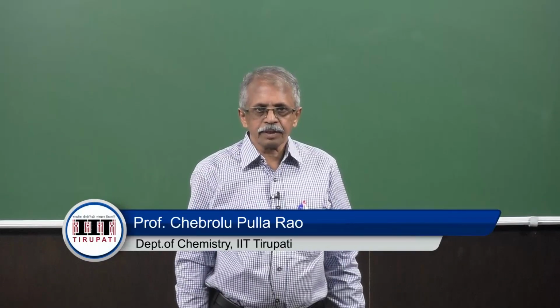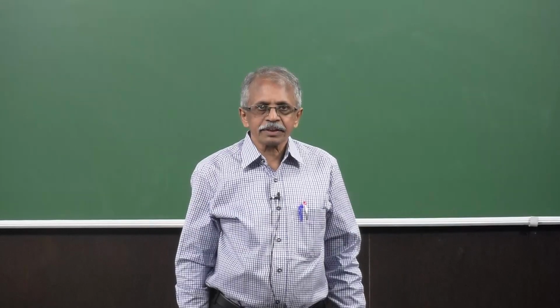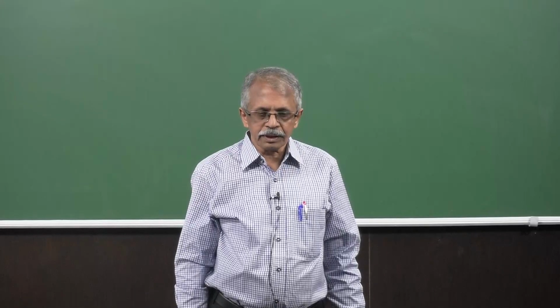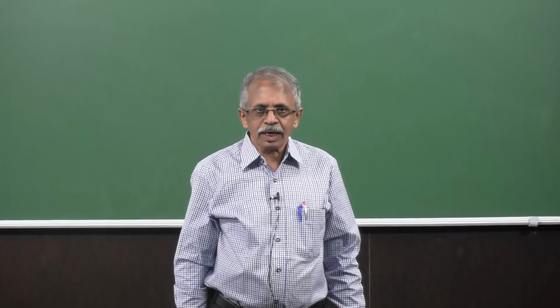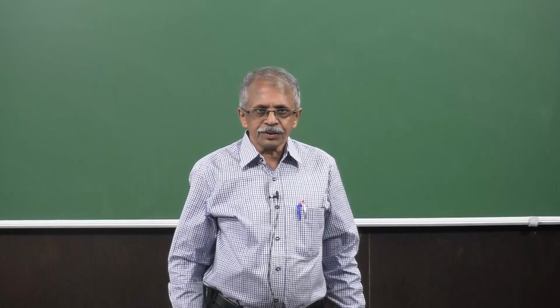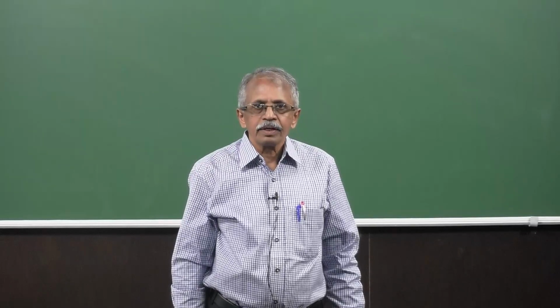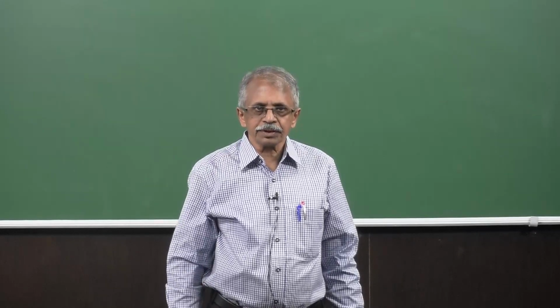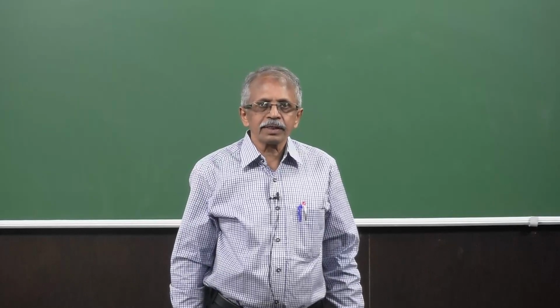Good morning. Welcome you all to this next lecture in this particular course on analytical spectral microscopy applications of inorganic compounds and nanomaterials. We have been doing in the past 3-4 classes or so on the microscopy aspects, and we have looked at the general principles, some more details into the atomic force microscopy, which does not use any electrons, etc., uses some kind of a tip to touch the surface of it. Looked at some examples of how one can utilize AFM.